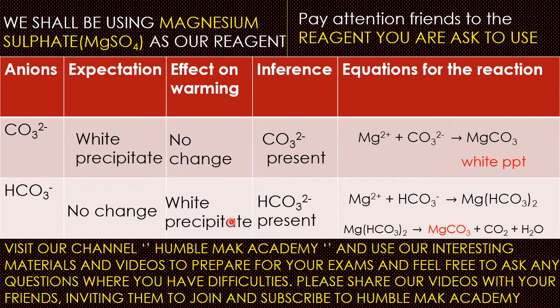Keep in mind, guys, that each time you're being asked to heat, the question might not tell you to use the litmus paper, but always go with it. Always make sure you moisten it in water before you go with it. Since carbon dioxide, as you all know, is an acidic gas, it is going to turn the blue litmus paper to red. So when reporting, also attach it. Though the question might not ask you to go with it, as you know the chemistry, it is so important to go with it each time you're dealing with gases.